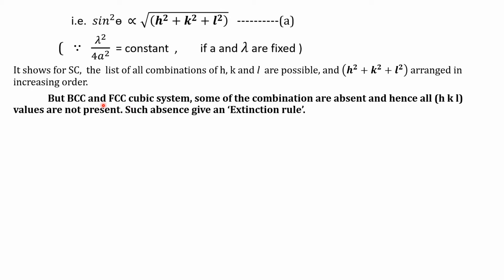Now, how do we know which diffraction lines are absent, meaning not present in such a system? That is determined by calculating the structure factor.